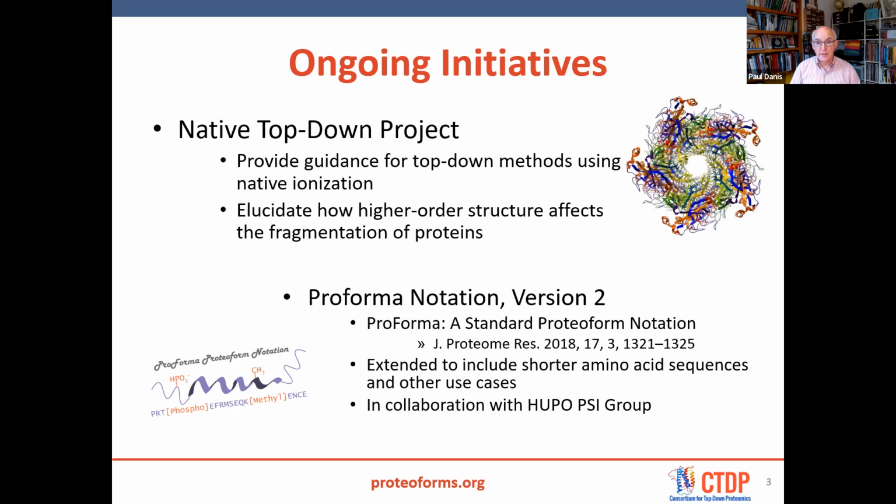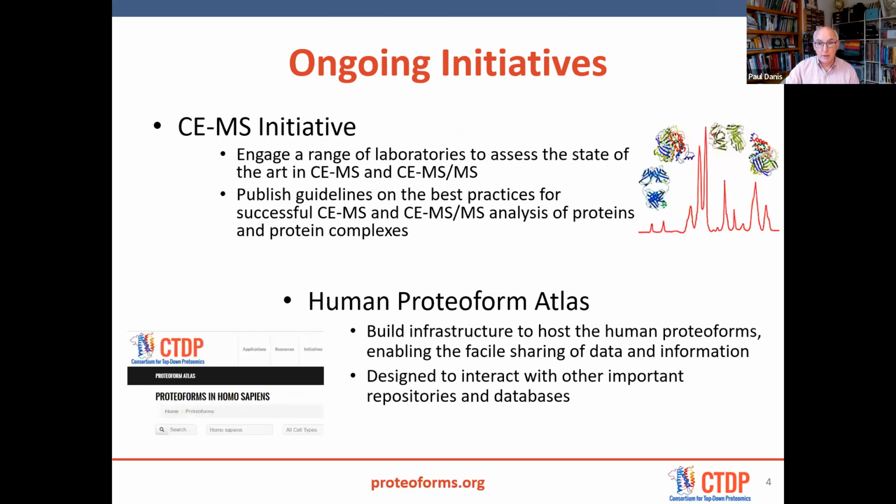A second is the ProForma notation, which is something we published a couple of years ago, but in collaboration with the HUPO PSI group led by Juan Vizcaino, we're updating that to include shorter proteoforms, also known as peptides, as well as some other use cases, so that we'll have this kind of universal language that's both human readable and machine readable. And that'll be something that also facilitates data sharing as well.